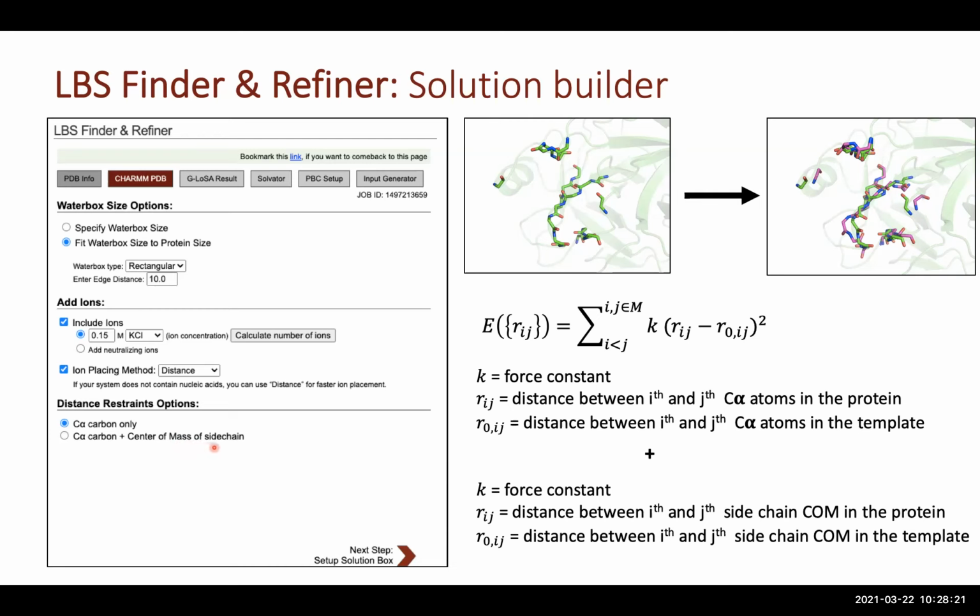From this specific example that you saw for that protein 1 PDB, we saw that residue Q37 side chain was facing the inside of the binding site, and we want to improve that side chain conformation. So we would use the second option for that.